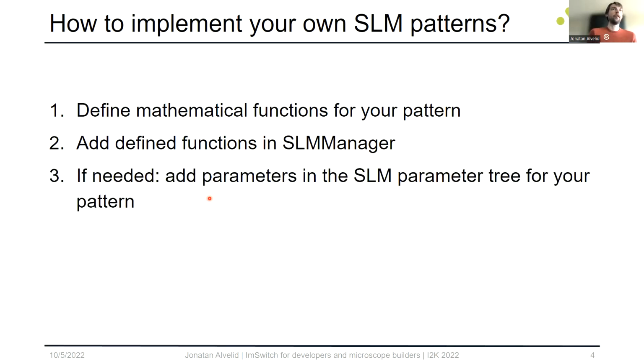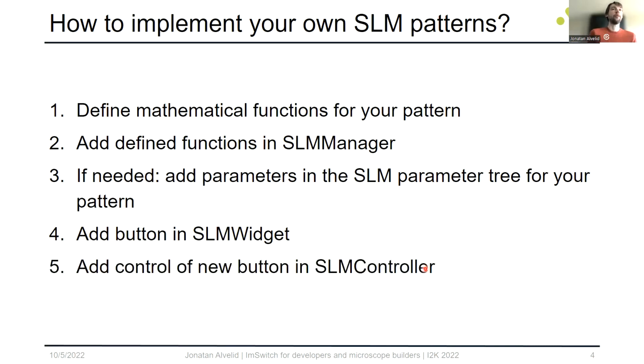If your pattern needs certain additional parameters that you want the user to be able to control, you also need to add them in the SLM parameters tree that I just showed you in the widget. You also need a button to be able to switch to your pattern, and you need the SLM controller to basically coordinate all of this control with the SLM manager in the backend.